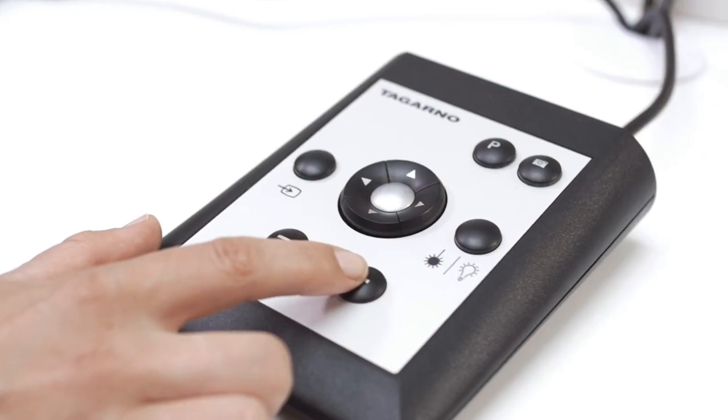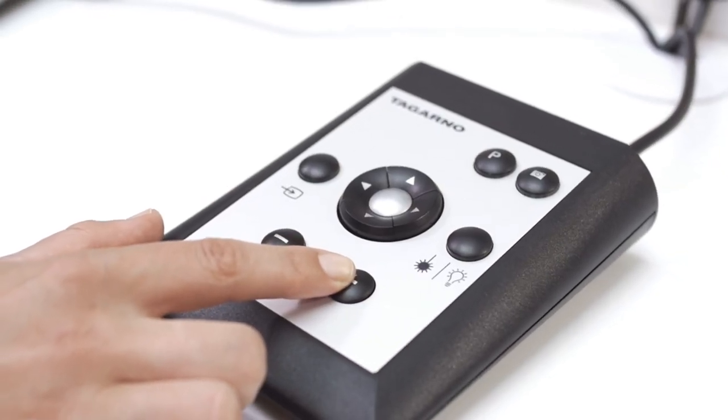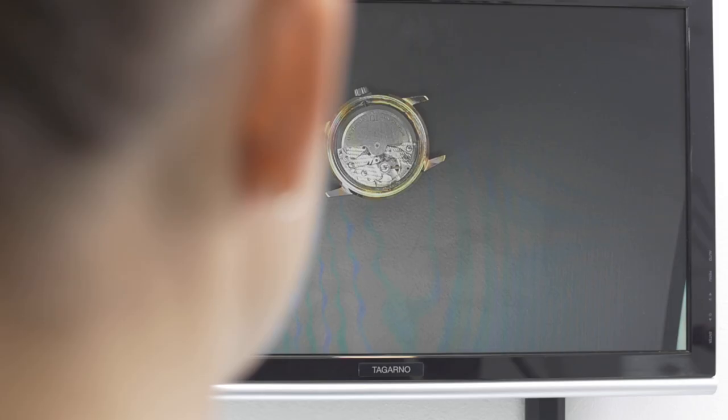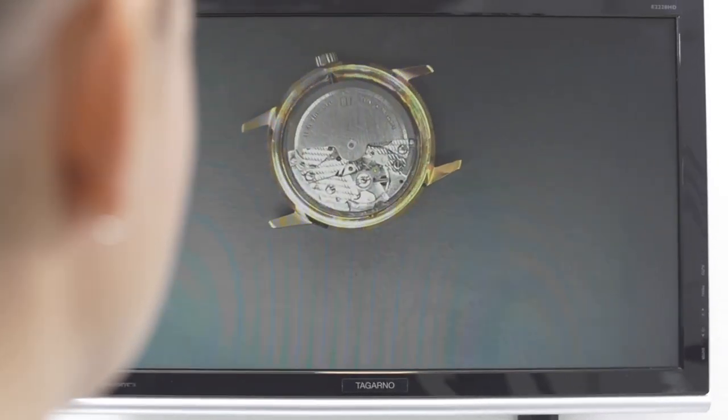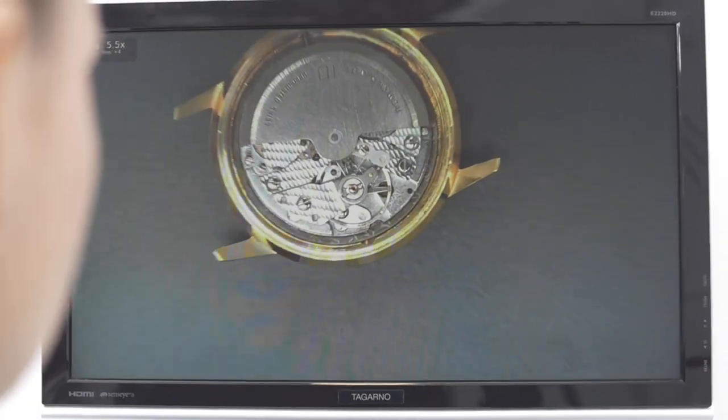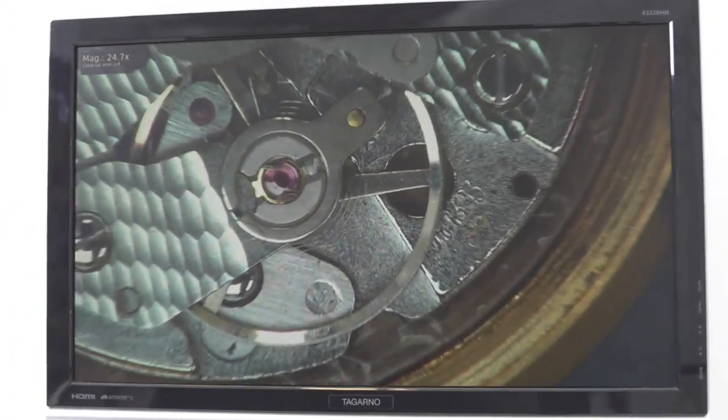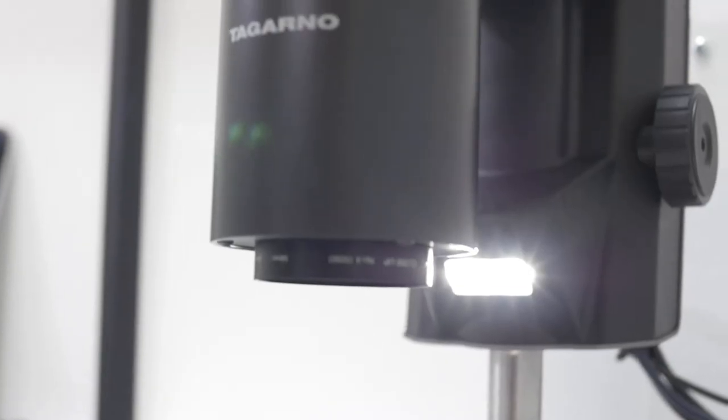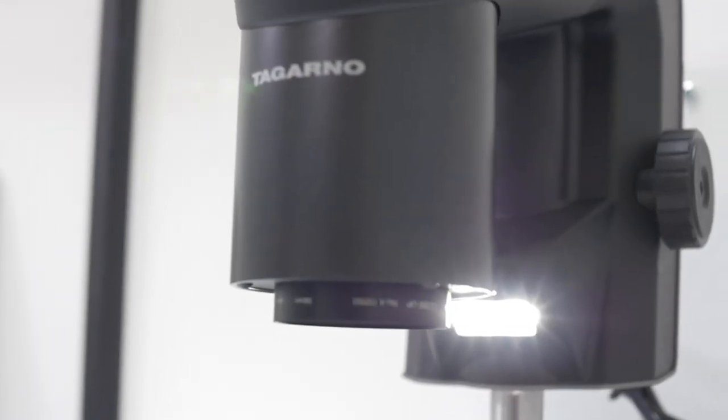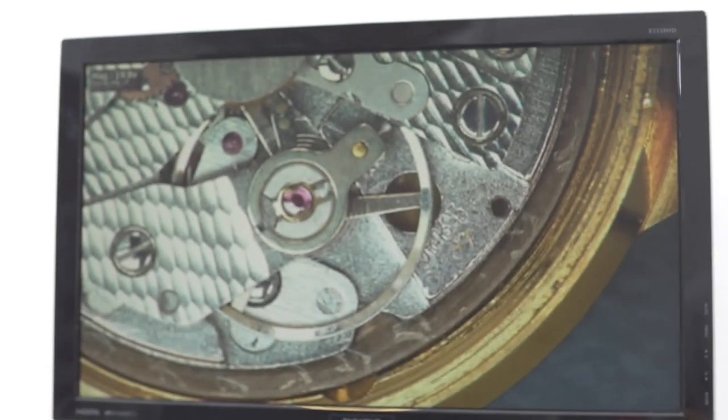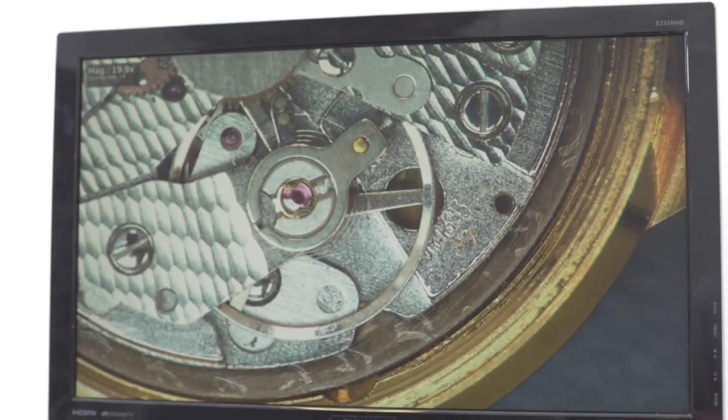My Targano is a great magnification tool which perfectly reproduces the object I put under the camera by using optical zoom, ultra-high frame rates, and 1080p image quality displayed.